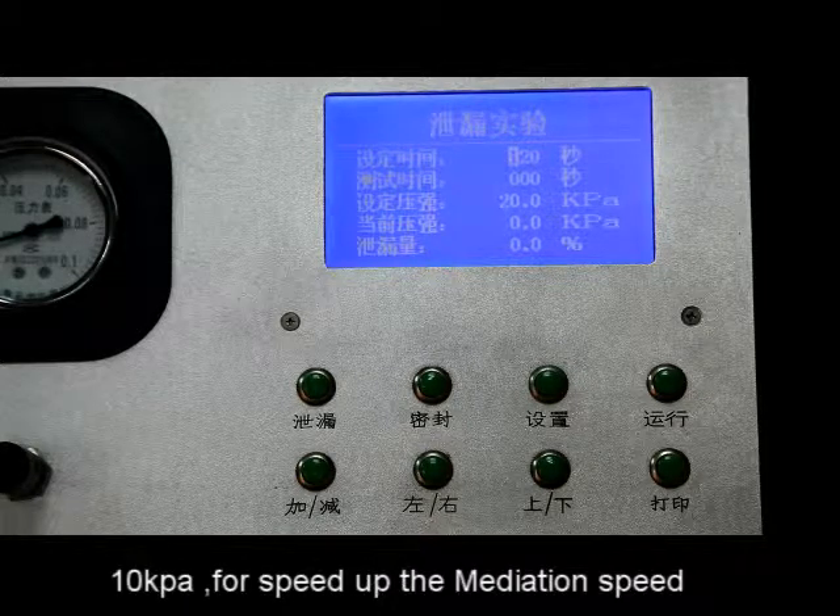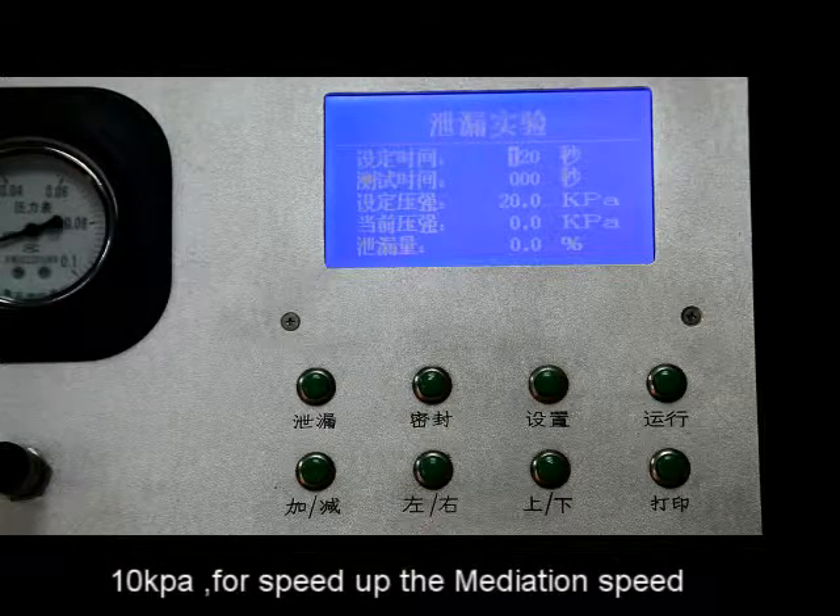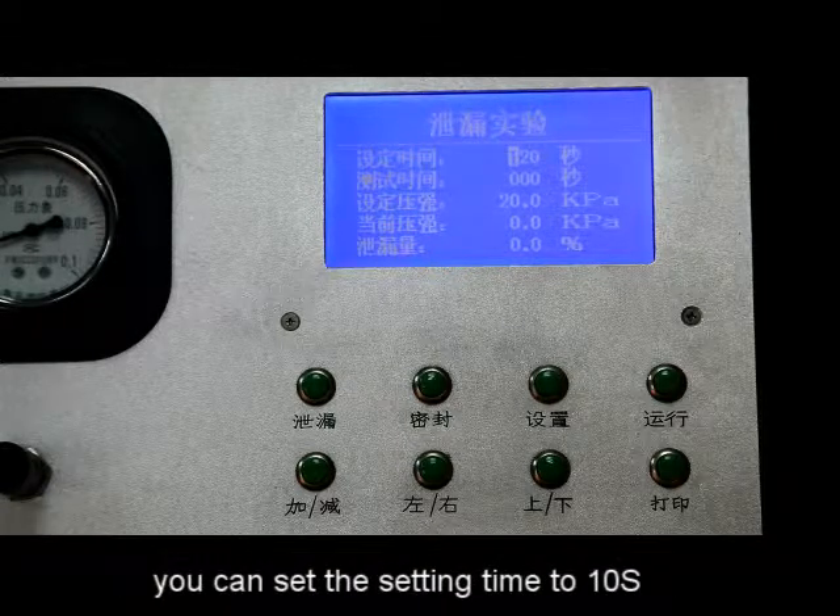For example, set to 10 kPa. After adjusting the speed, you can set the setting time to 10 seconds.